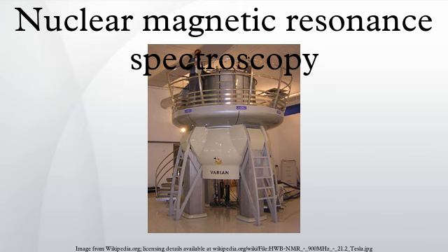Correlation spectroscopy. Correlation spectroscopy is one of several types of two-dimensional nuclear magnetic resonance spectroscopy, or 2D NMR. This type of NMR experiment is best known by its acronym, COSY. Other types of two-dimensional NMR include J-spectroscopy, exchange spectroscopy, nuclear Overhauser effect spectroscopy, total correlation spectroscopy, and heteronuclear correlation experiments, such as HSQC, HMQC, and HMBC.